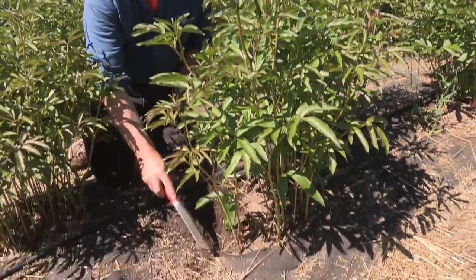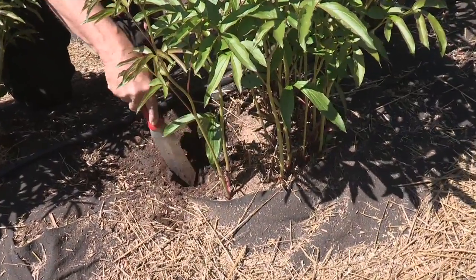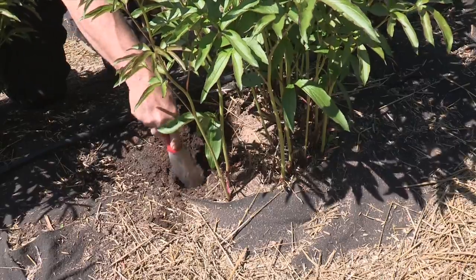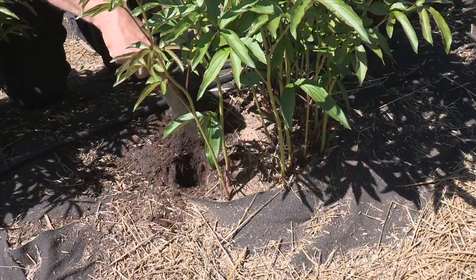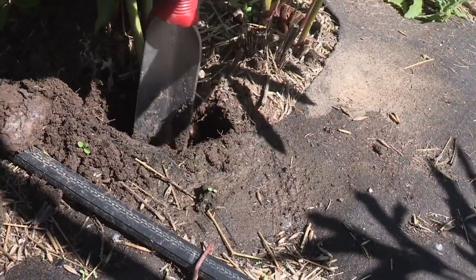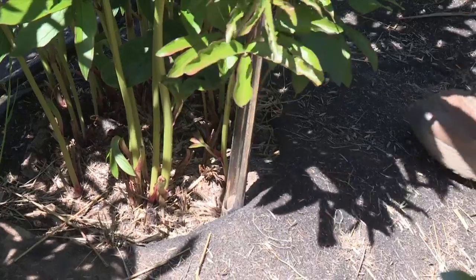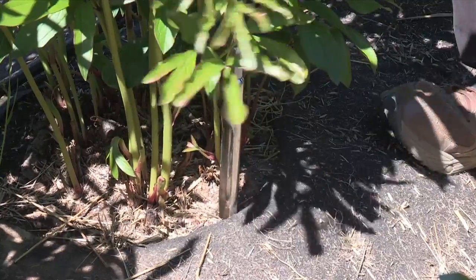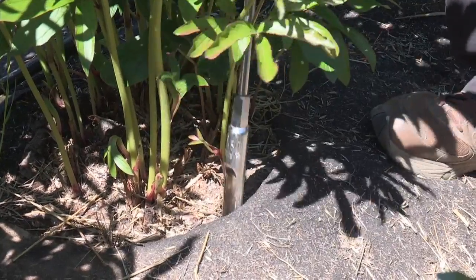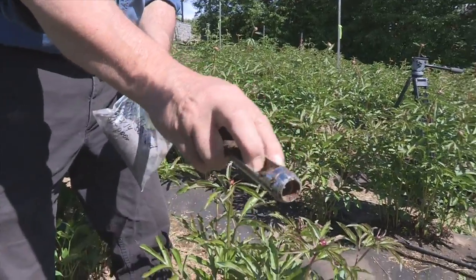Starting a few inches away from the base of the plant, on any side, slowly insert the probe or trowel with just enough pressure to penetrate the soil surface. If you feel resistance, stop, as you may have encountered a major root. Move over a few inches and try again. Once you've reached a 6-inch depth with the probe, remove it from the soil and slide the soil sample out and into a 1-quart size zipper-type plastic bag.